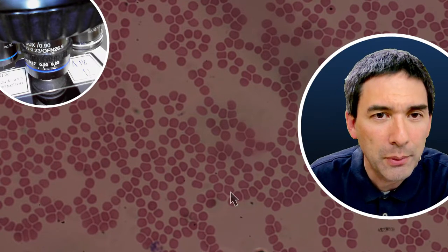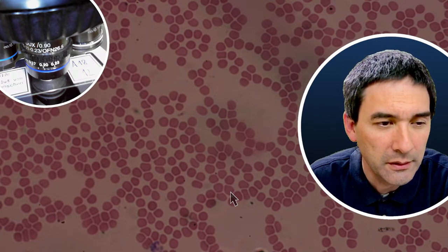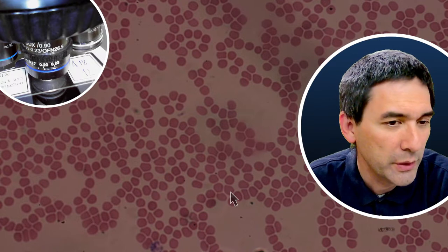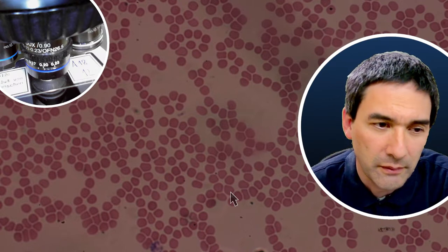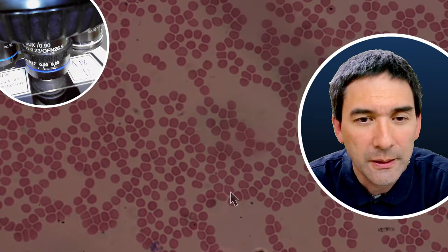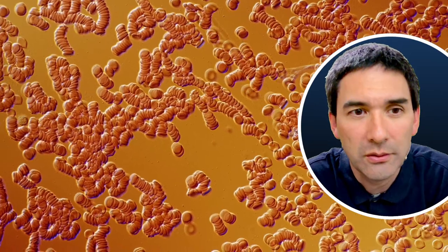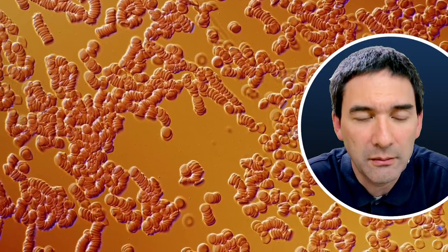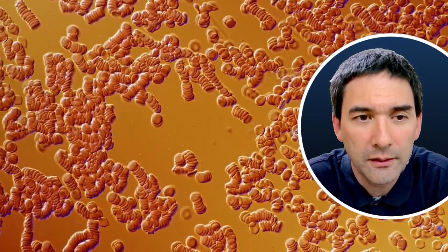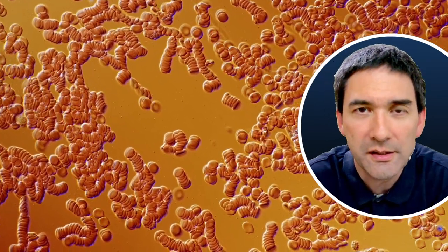However, I personally think if you look at blood live under the microscope, it's much more interesting. So I'm just going to show you again one of my videos. Some of you have already seen them. These are basically red blood cells, my own. And you notice one thing, and that's also the reason why I showed it to you. Oh my gosh, the red blood cells are stacking up.